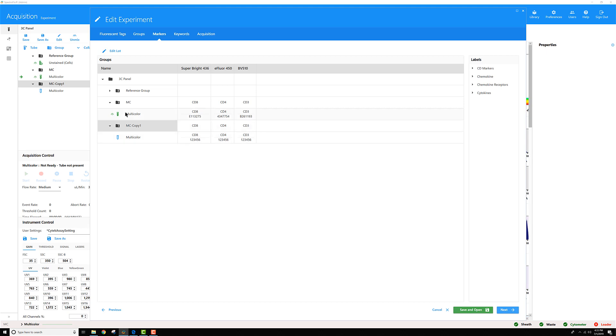For one of the multicolor tubes, I added CD8, CD4, and CD3, and for each one I specified a specific lot. The second group uses the same three markers, but I'm going to specify a different lot.